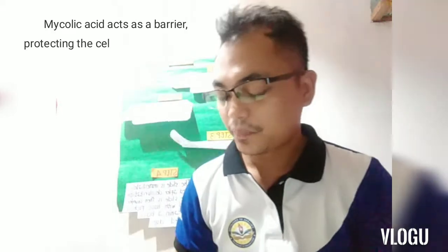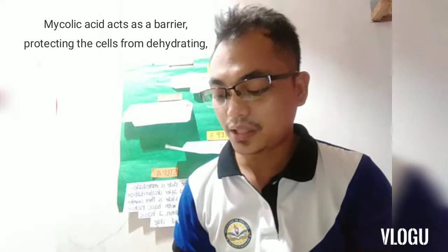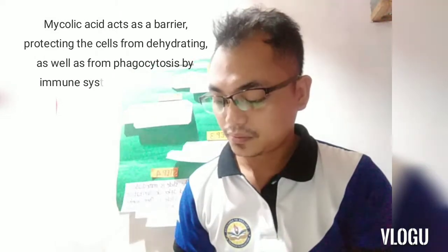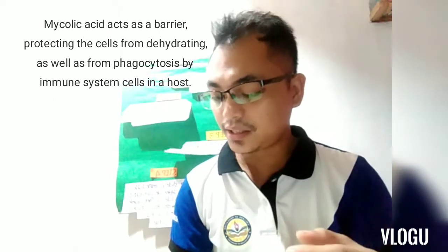The second is acid-fast staining. It differentiates between cells that have mycolic acid present in their cell walls, the acid-fast, and those that do not, the non-acid-fast. Mycolic acid is a waxy lipid. And these are the third example.